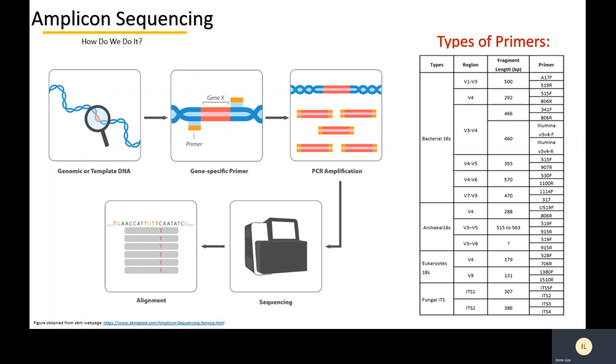Samples are then pooled, and we prepare a library by adding adapters and enriching the target regions. The reason we add adapters is to make sure that the indexed amplicon adheres to the flow cell for sequencing. Once sequencing is done, all the raw reads are trimmed, and we align them to obtain the full sequence that was amplified earlier. So it has to be similar.